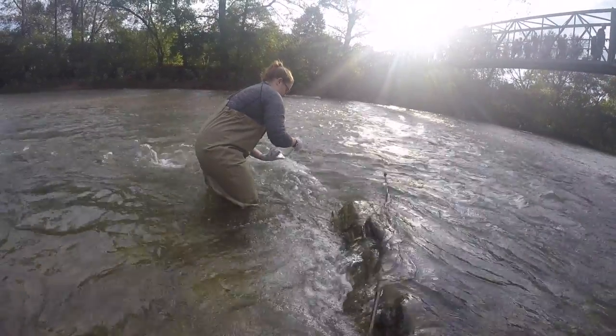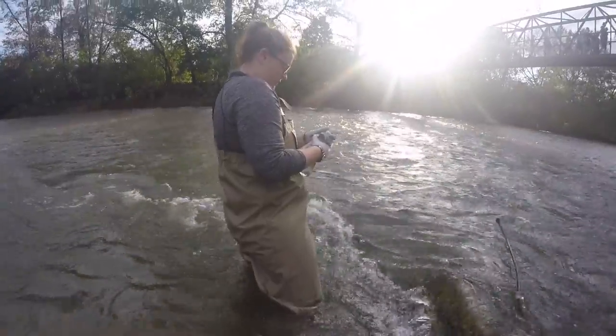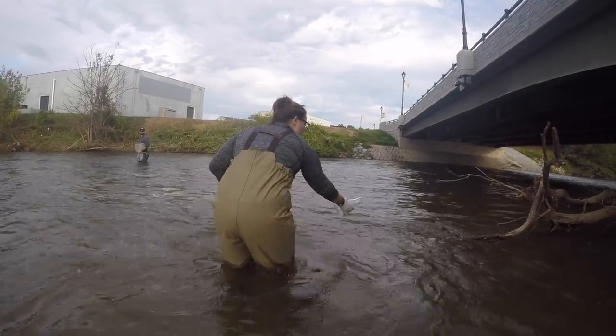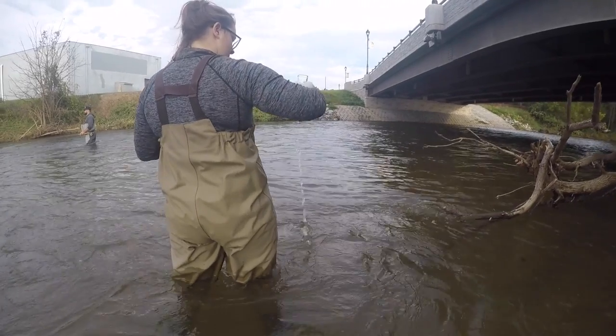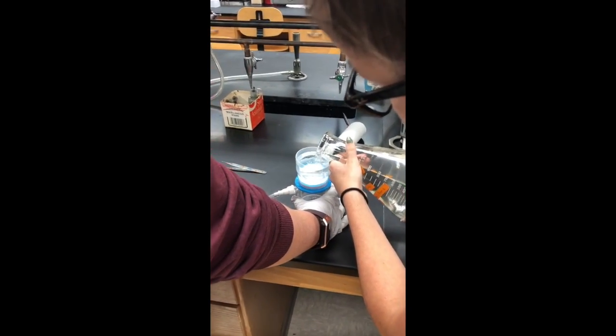For our experiment, we collected both mercury-contaminated and uncontaminated water from 2 different locations at South River. According to a 1977 report by Carter, DuPont Company released mercury in the river from 1929 to 1950 via a malfunctioning waste pipe. After water collection, we filtered the water using standard filtration methods.